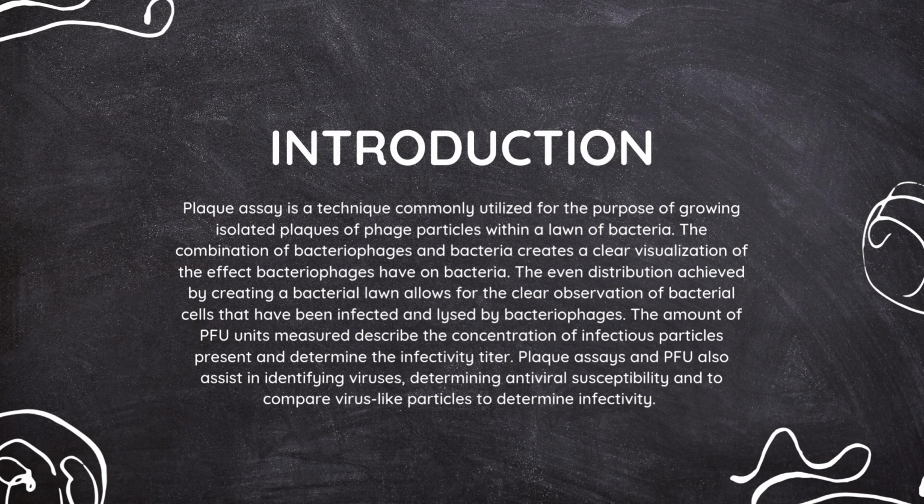Plaque assay is a technique commonly used for the purpose of growing isolated plaques of phage particles within a lawn of bacteria. The combination of bacteriophages and bacteria creates a clear visualization of the effect bacteriophages have on bacteria. The even distribution achieved by creating a bacterial lawn allows for clear observation of bacterial cells that have been infected and lysed by bacteriophages.